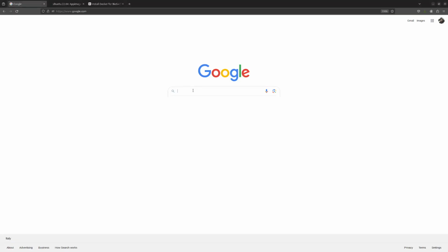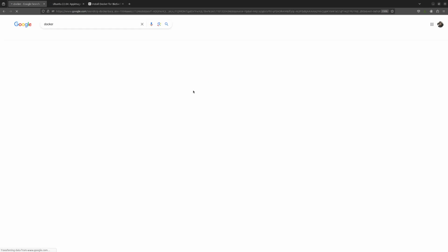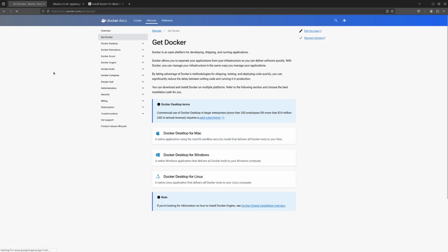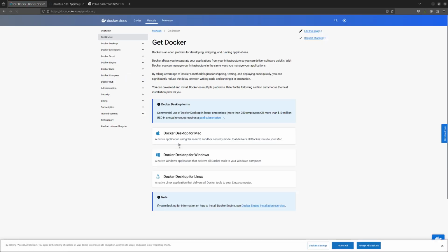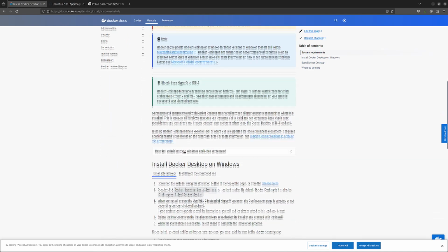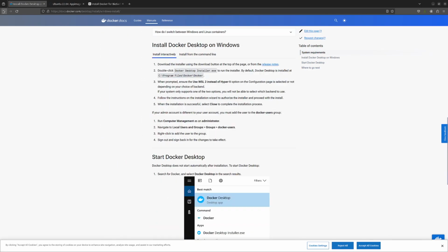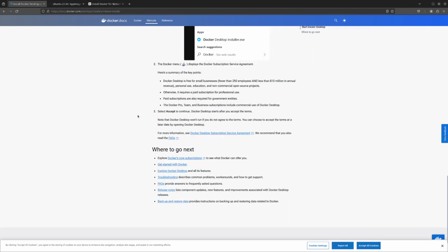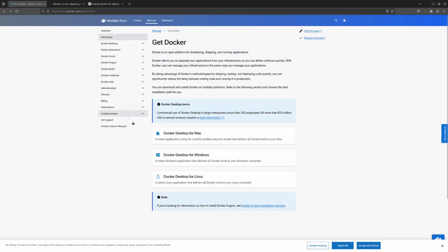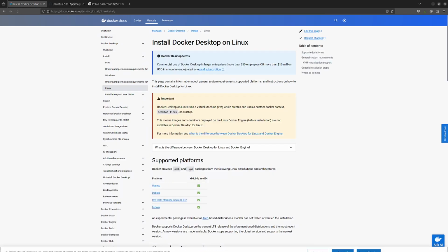Before starting, make sure you have installed Docker on your system. If you haven't done so yet, please visit the official Docker website and download the latest version of the software for your operating system. Once you reach the Get Started page, you can choose the appropriate Docker version for your operating system and follow all the steps to correctly install the software on your machine. Once Docker is downloaded and installed, you are ready to use BioSwiftAnalytics.